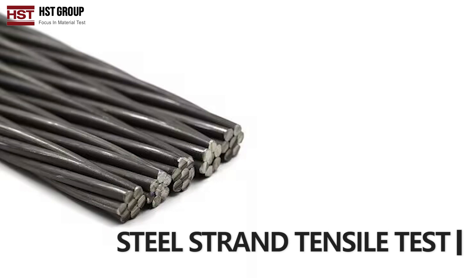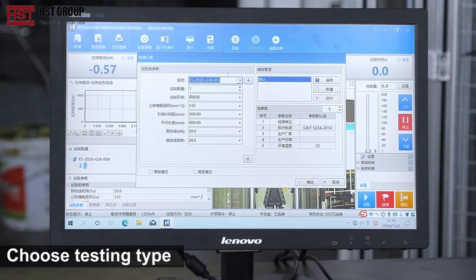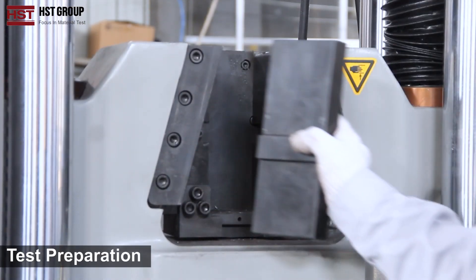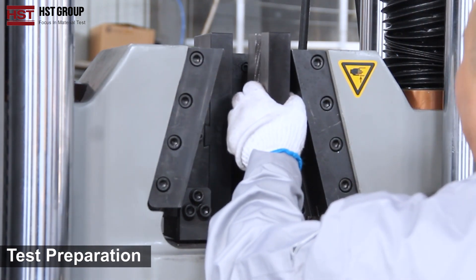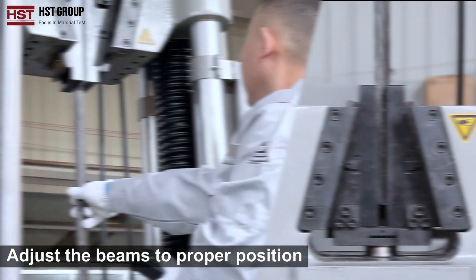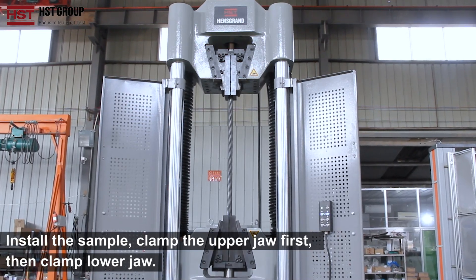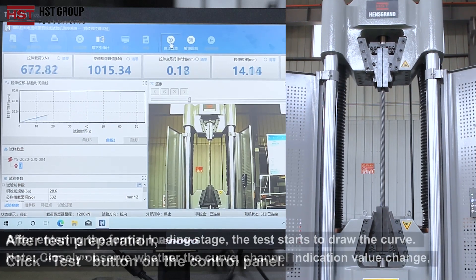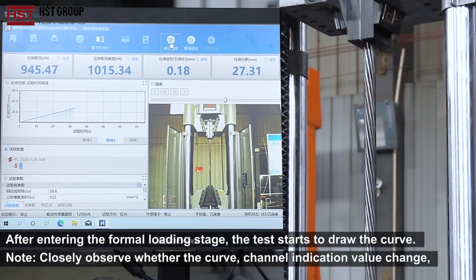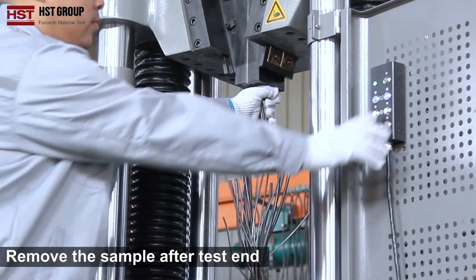Steel Strain Tensile Test: Choose testing type, set up new record. Test preparation: adjust the beams to the proper position. Install the sample — clamp the upper grip first, then clamp the lower grip. After test preparation, click the Test button on the control panel. Remove the sample after the test ends.